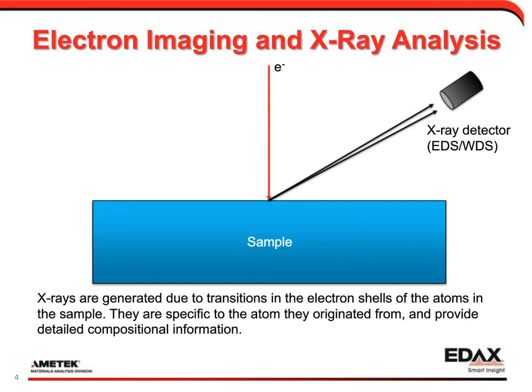Compared to the WDS, where you measure wavelength by wavelength. Having an optics background, I basically think of them as a spectrometer and a monochromator. So the WDS is much slower to acquire than the EDS, and typically only looks at individual peaks in one go. But it does have significantly better resolution than the EDS on the given peaks. But we're going to stick to EDS today, at least.